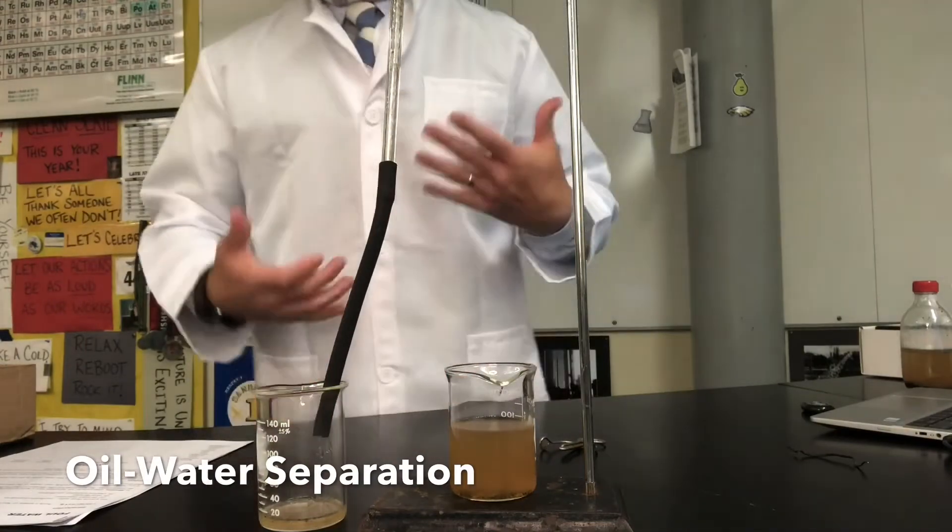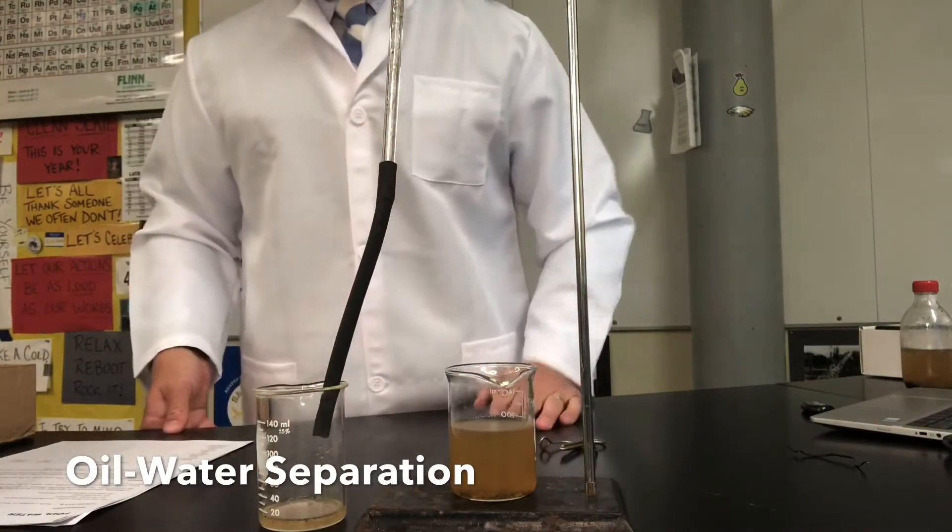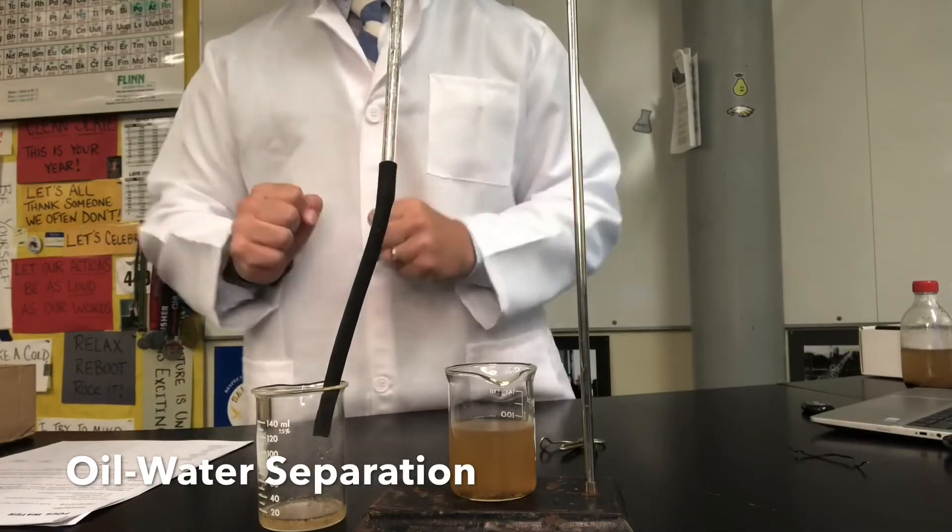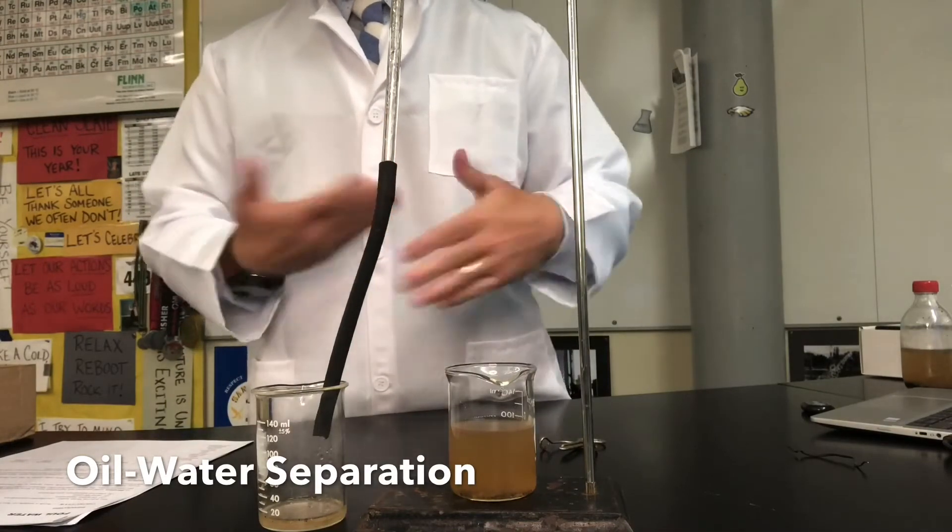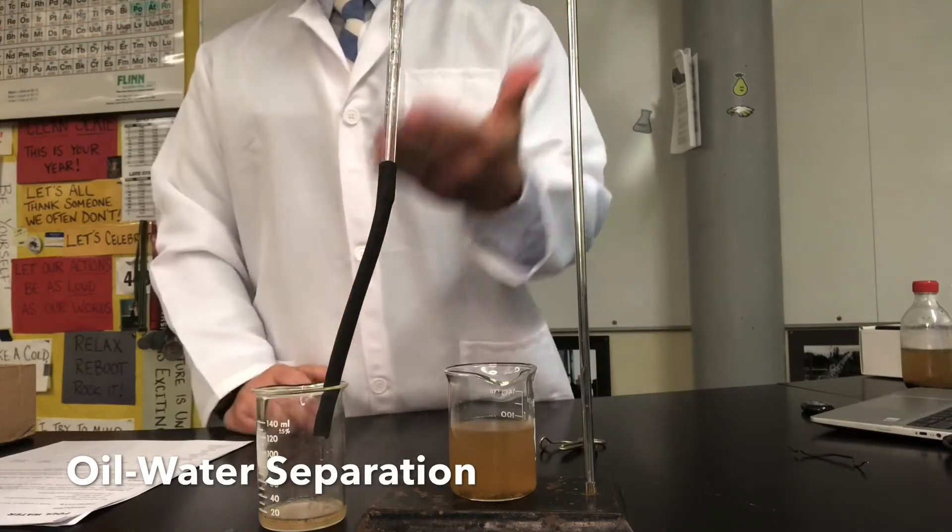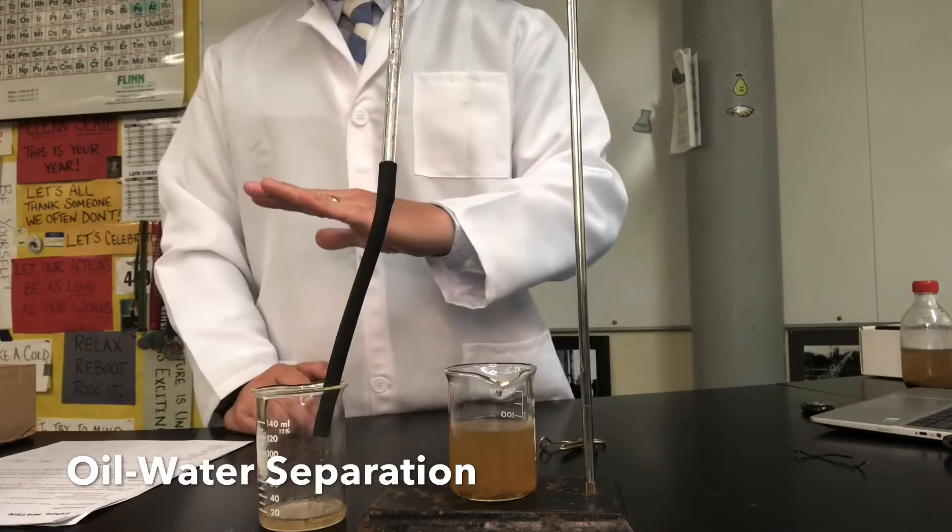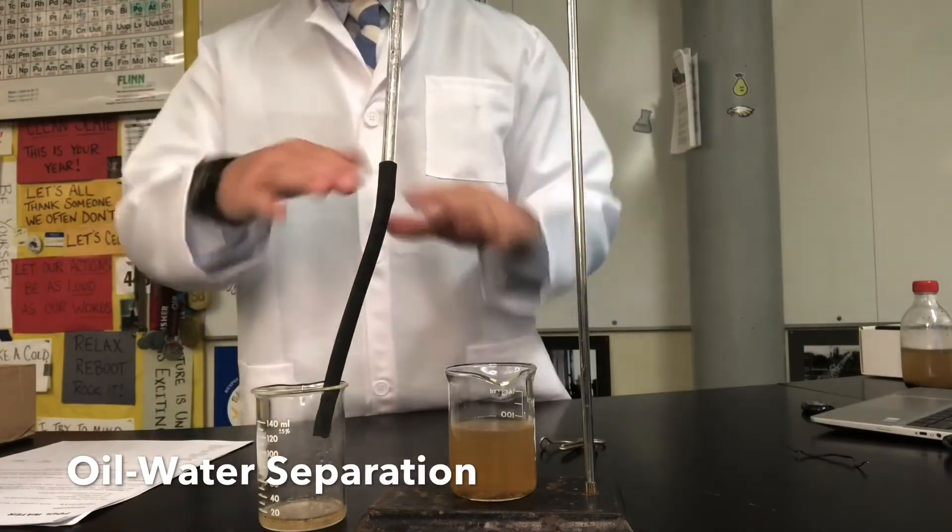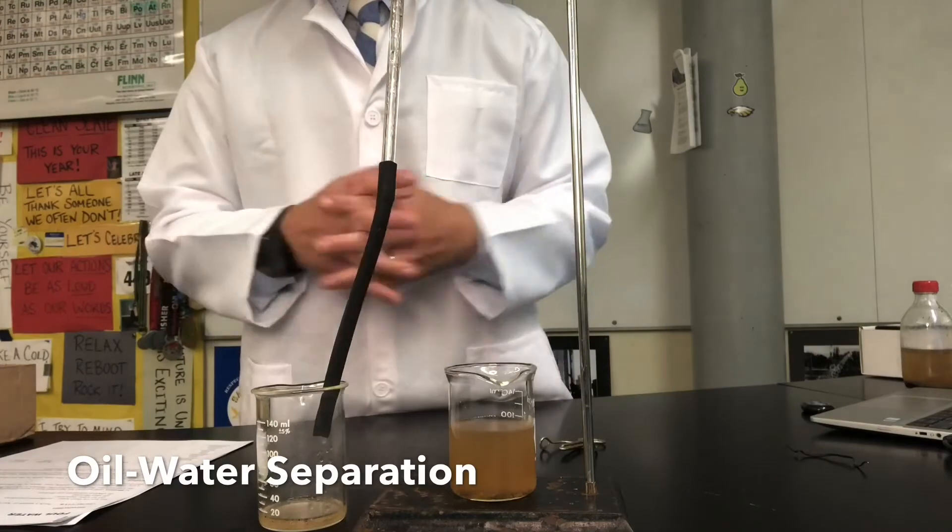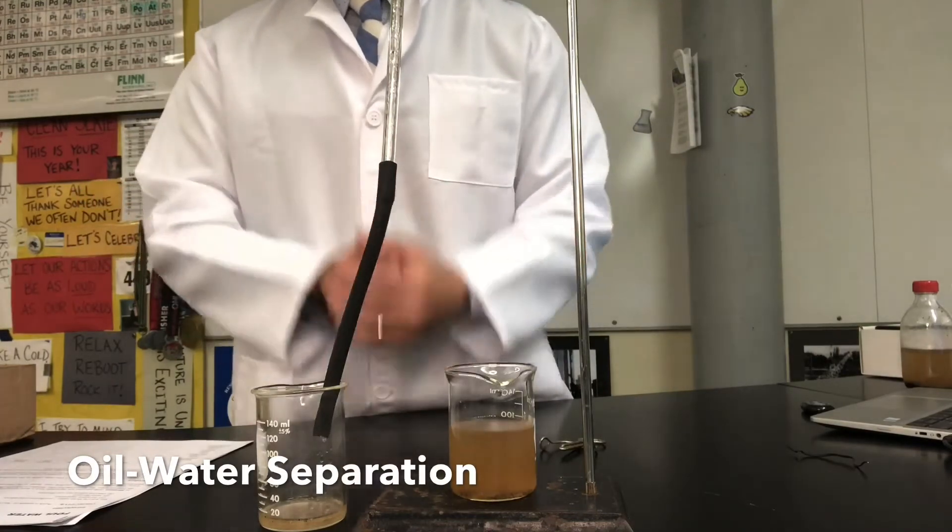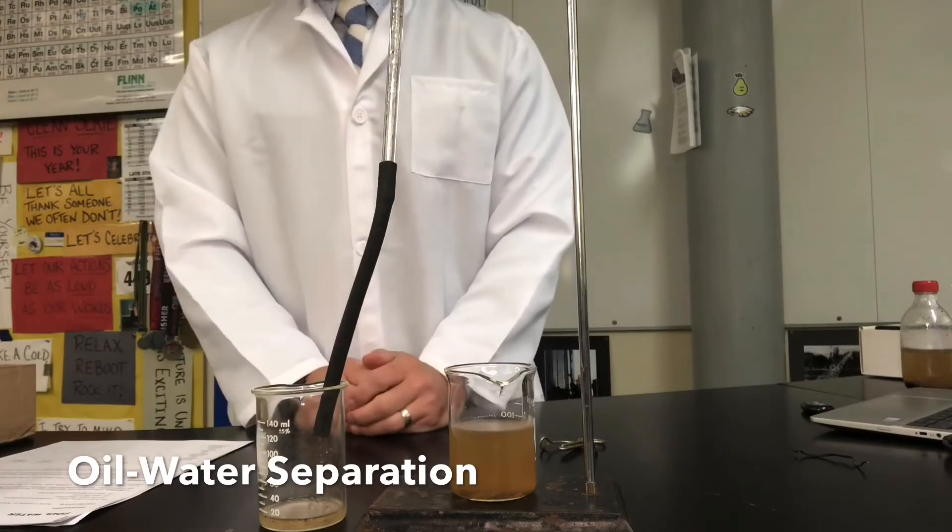Remember in a heterogeneous mixture there's just a bunch of different things mixed together and you can physically separate them in order to make something more pure or by itself. So we did a physical separation by taking out the oil. We didn't use a chemical reaction or anything crazy, we just used their densities to separate them out and physical properties fall under things like density so that was an easy way to figure that out.